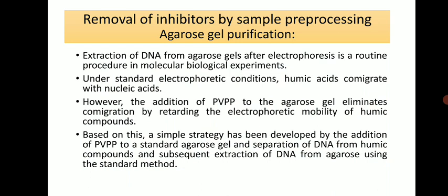Removal of inhibitors by agarogel purification: extraction of DNA from agarogels after electrophoresis is a routine molecular biology procedure. Under standard electrophoretic conditions, humic acid migrates with nucleic acids. However, migration of humic acid is inhibited by adding PVPP to the agarogel, which eliminates co-migration by retarding humic acid movement so only DNA moves in the electrostatic field. A simple strategy involves adding PVPP to standard agarogel, separating DNA from humic compounds, and extracting it using standard methods.